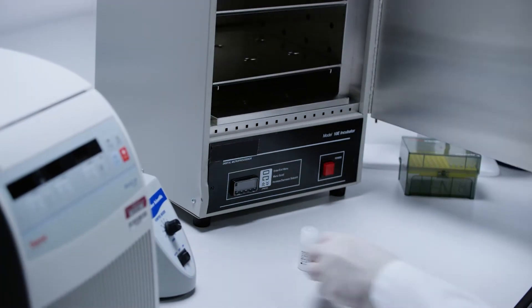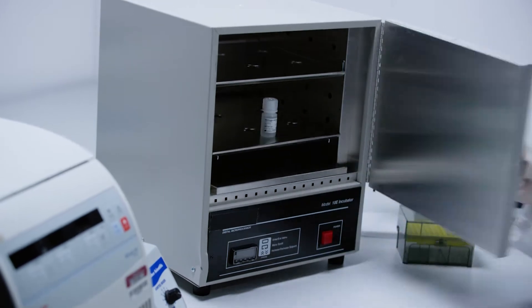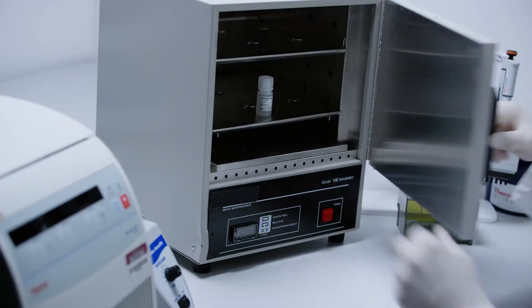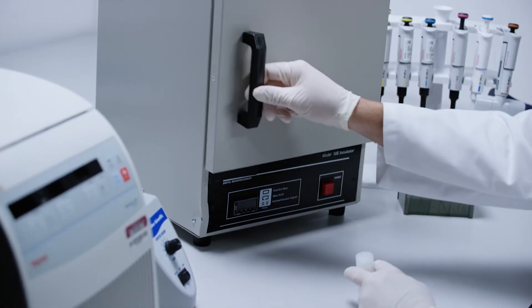Begin the assay using the chosen incubator to pre-warm the lysis mixture at 37 degrees Celsius for 30 minutes, followed by gentle swirling. Store at room temperature until usage.